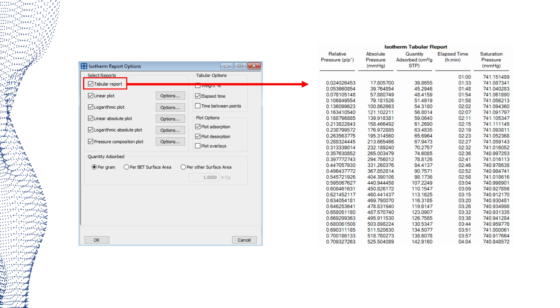In general, as the relative pressure drops to below 0.01, it'll generally take longer for equilibration to occur in the smaller pores. Since you fill the small pores at the smallest relative pressures, oftentimes it takes the longest amount of time just due to diffusion of your adsorbing gas, such as nitrogen, into the pores of those materials.